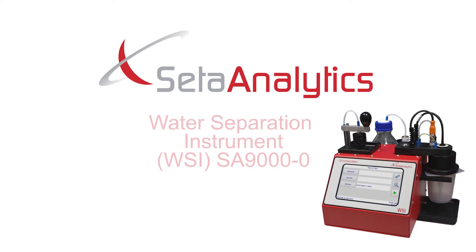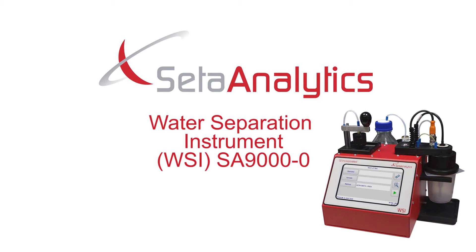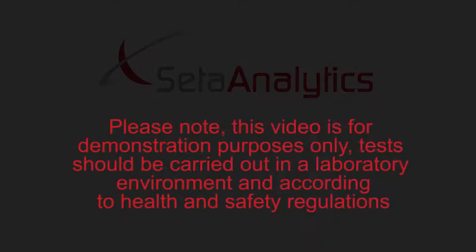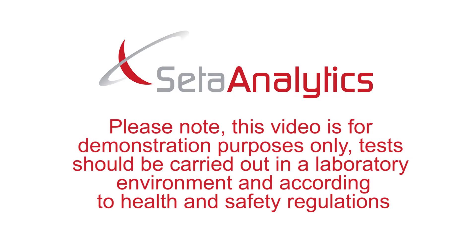Hello and welcome to your new WSI water separation instrument, the SA9000-0. In this video we will show you how to set up your instrument ready to run a test. Please note this video is for demonstration purposes only. Tests should be carried out in a laboratory environment and according to health and safety regulations.